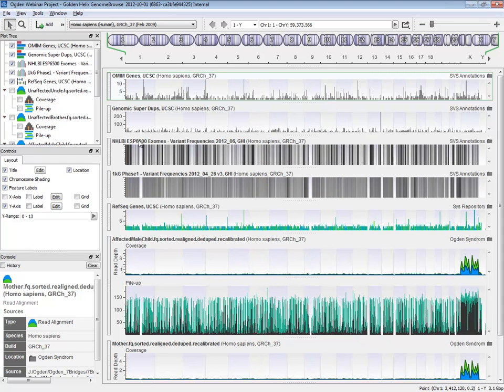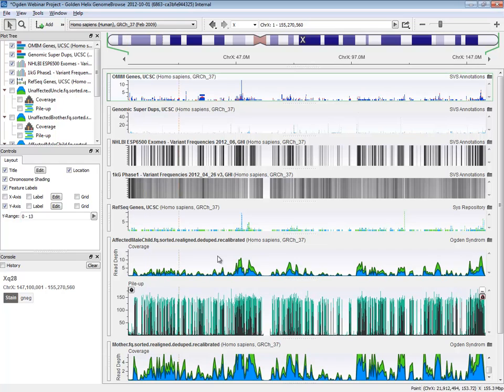Here's our 6,500 exomes, 1,000 genomes, our reference sequence, our affected male, the mother, etc. You can see at a whole genome level, the data is definitely focused at the coverage, peaks up above the baseline at the X chromosome. Let's go ahead and double click on X, and we can see the coverage here.